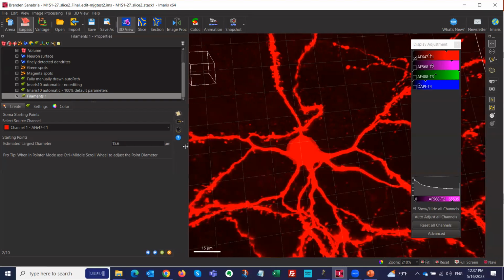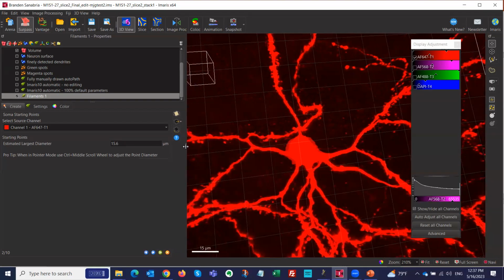So it started again with the filament tracer with Imaris 10, and then it will go on. Probably, and this is my assumption, I don't know it yet, the cell object will get similar treatment next, because unfortunately cell is still limited by sequential processing. The cell object is not parallel computing either yet. So this will also hopefully soon get machine learning plus parallel computing in it.